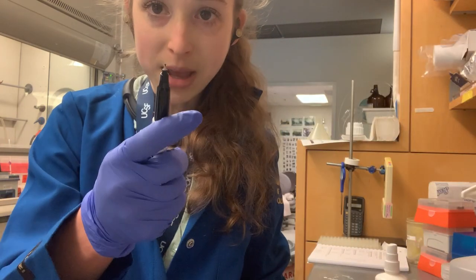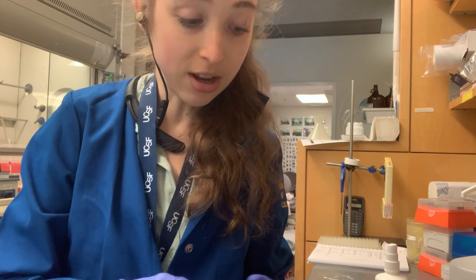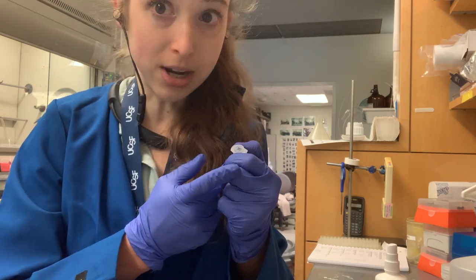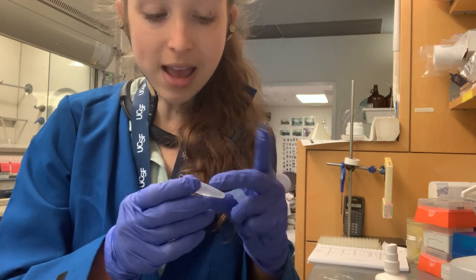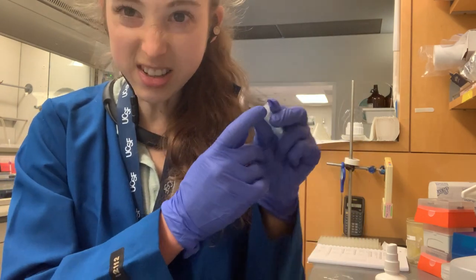They make lab pens that are more resistant to ethanol and that sort of thing, which is helpful. Getting back to those smaller tubes — you can't fit as much on the top, but you still want to put something on the top as well as on the side, so that when you have your box of tubes, you can see what's on the cap.